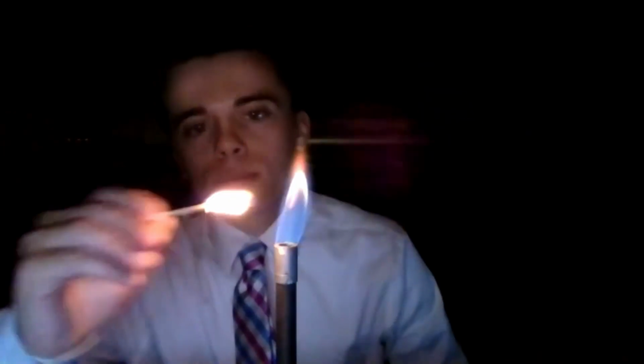And in this case, this one is actually strontium. Okay, so which one do we want to try and mix colors with? Or which two?